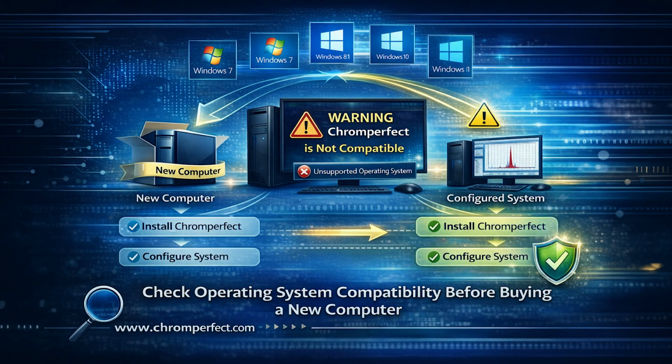Although the steps are largely the same, the exact files involved may differ when upgrading versions. Before purchasing or commissioning a new computer, operating system compatibility must also be considered. Chromperfect versions are often compatible only with specific versions of Microsoft Windows. A common problem occurs when a new computer is supplied with the latest Windows version, and the existing Chromperfect software is not compatible with that operating system. In those cases, an upgrade may be required before the software can be used reliably.